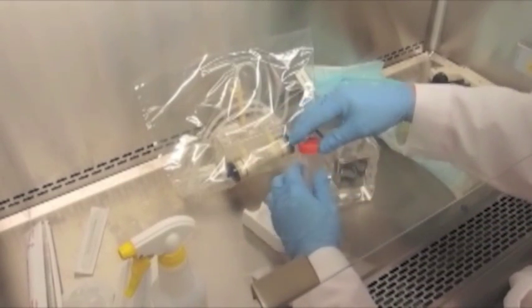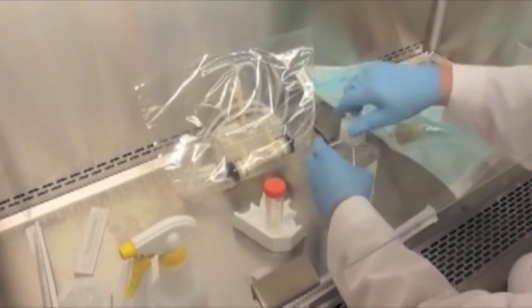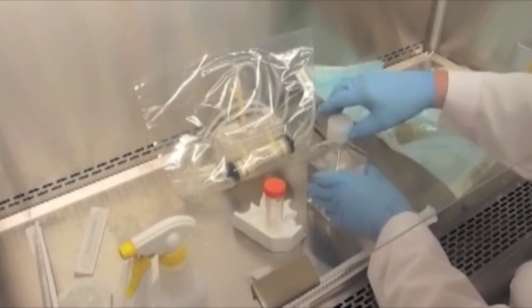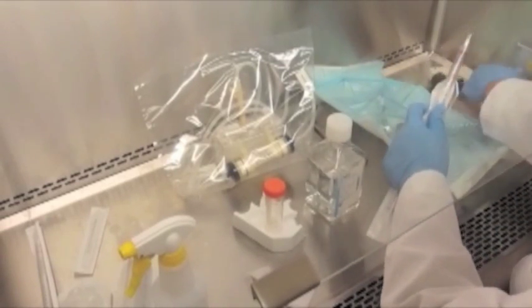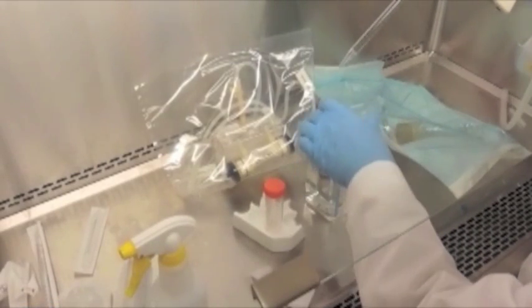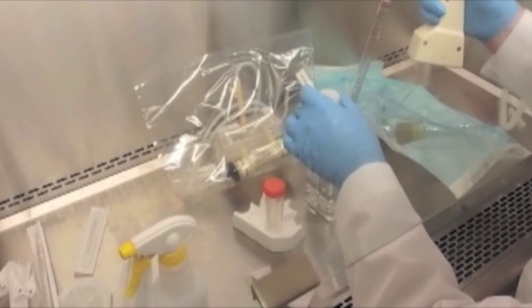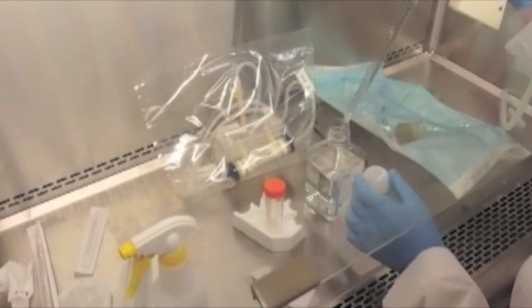We're going to prepare 50 ml of PBS in our conical centrifuge tube in order to fill the extracapillary space with it after we attach the cartridge to the bottle of PBS. We found that PBS is a little more effective at removing the PVP than straight cell culture media.